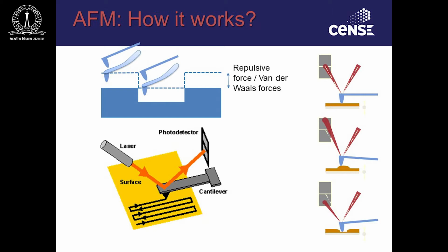So somewhat like this, as represented on the screen here. As the cantilever goes around this surface here, it moves away from the reference. So this spot, which was in the center of this photo detector, this is a photo detector, it moves away. That is kept track of and shown by the computer, or the computer keeps getting the data from this photo detector.